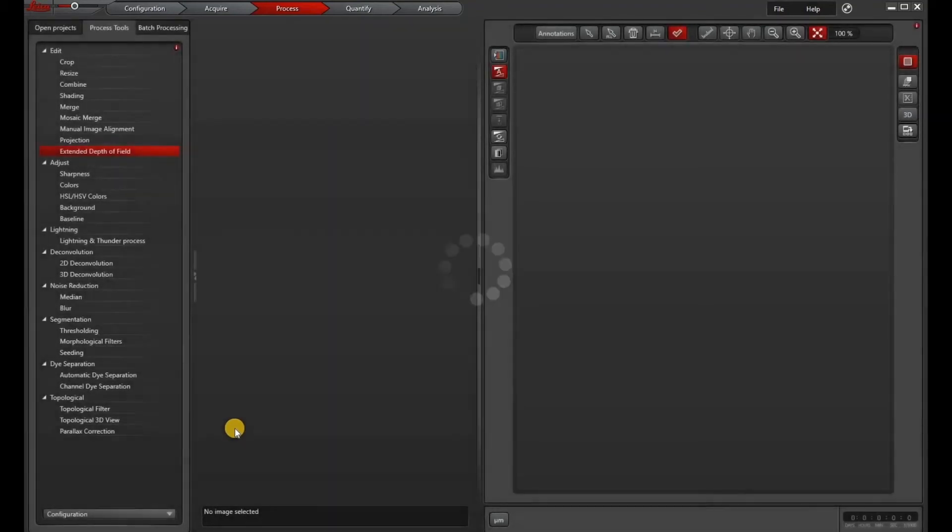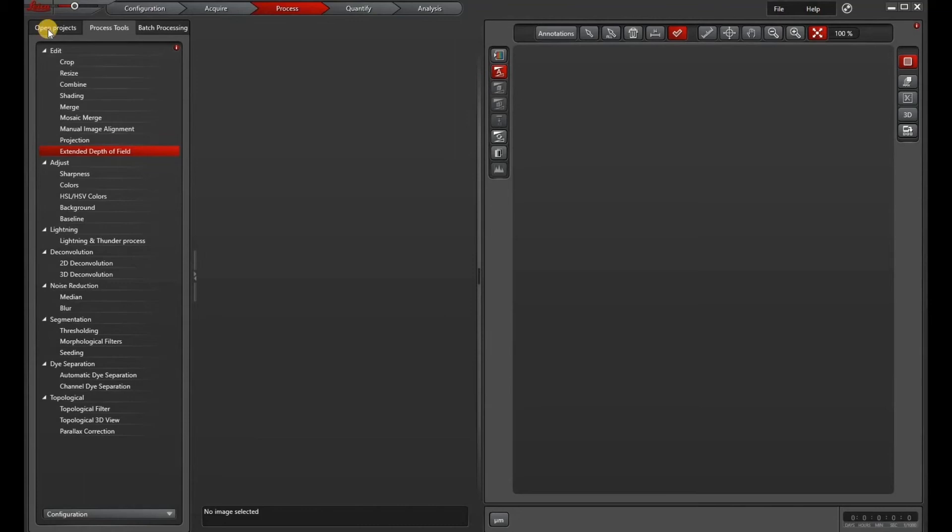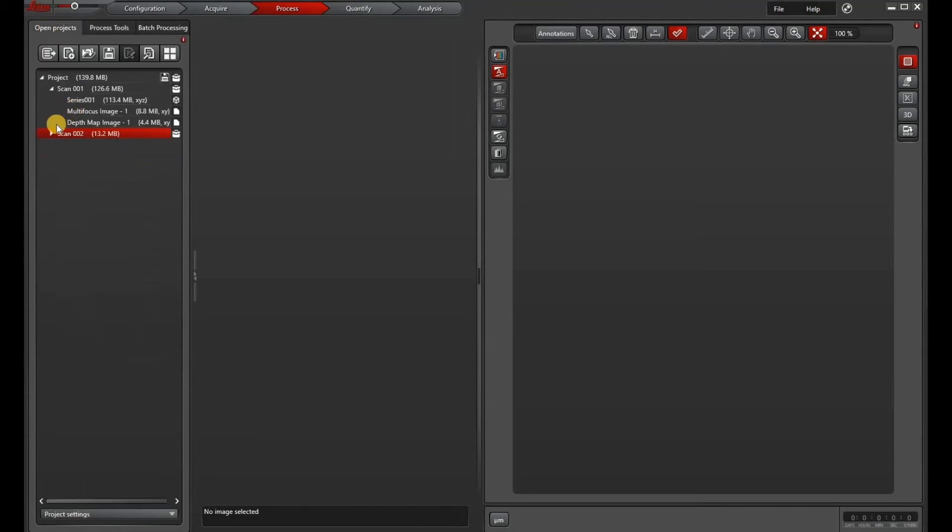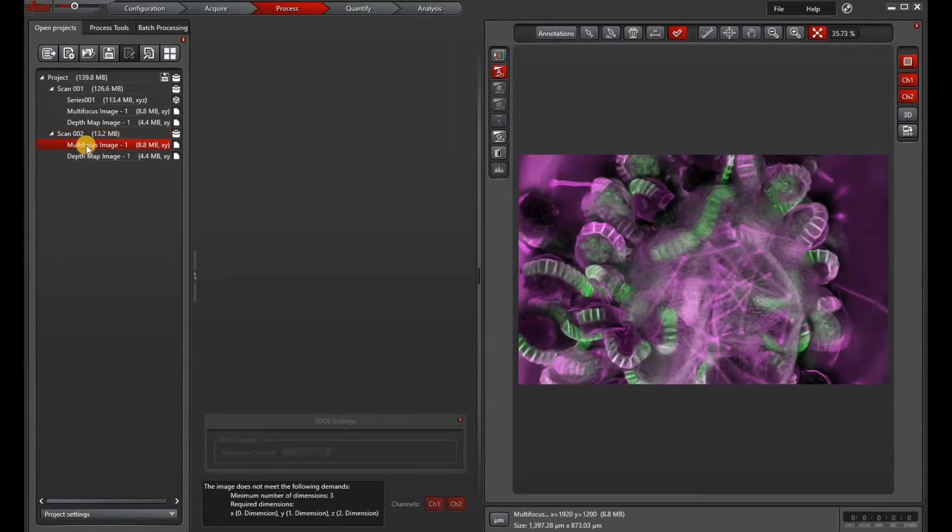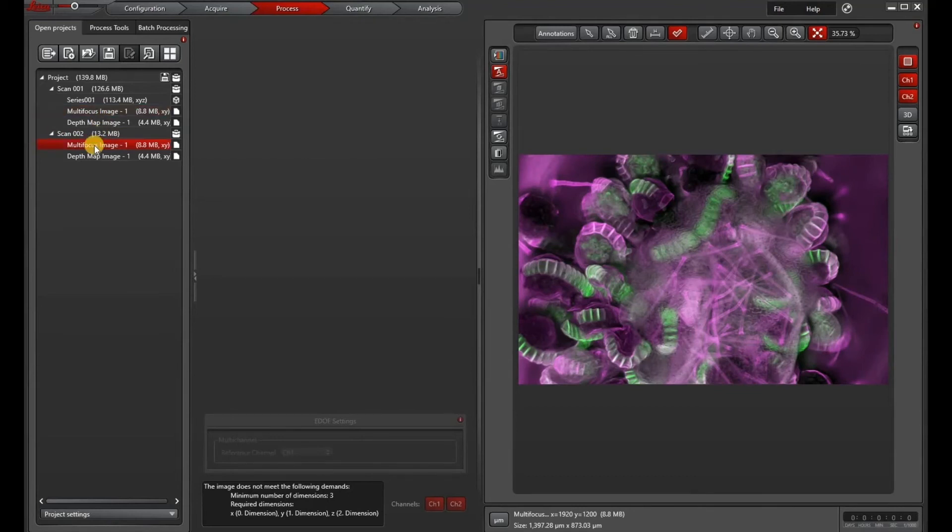Once your EDOF is done, you can go under open projects and then it'll appear under scan to or scan something and multi-focus image. You'll see that this EDOF looks exactly like the one that we did before.